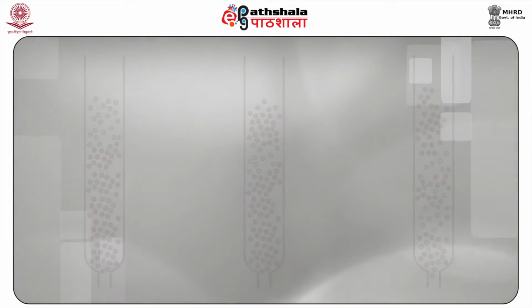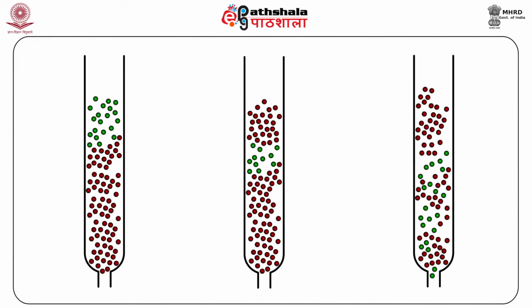Very large molecules, due to their exclusion, have no access to the mobile phase within the gel, hence have a Kd value of 0. Whereas smaller molecules for which the inner mobile phase is completely accessible have a Kd value of 1 or unity. Here you can see a figure in which we have depicted the separation of solutes during the gel filtration chromatography due to molecular sieving process. And you can see the gel matrix and the large and small molecules and how they get separated.